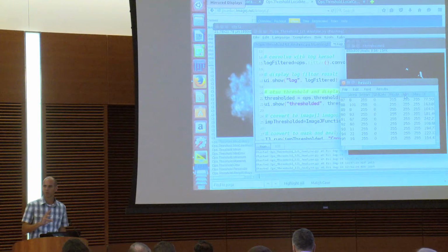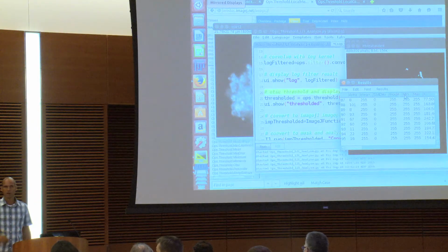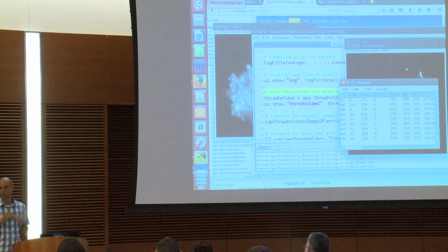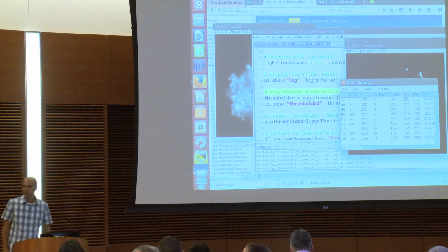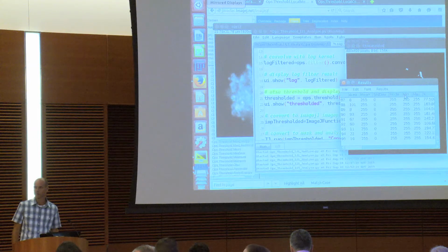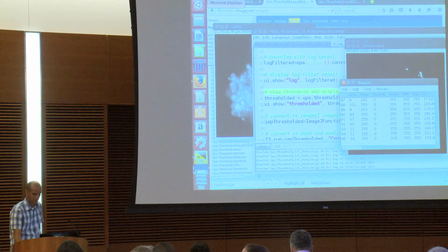And actually, I have a question right now. Sorry, for you, Curtis. Is there already or going to be some way to, if you know you want to use the threshold ops, have a parameter that gives you a list of what threshold ops are available? Is the parameter harvester going to be aware of an op? Like you could actually use an op for the parameter. I think it works now. If it doesn't, I certainly guess. Like a drop down list where you choose.